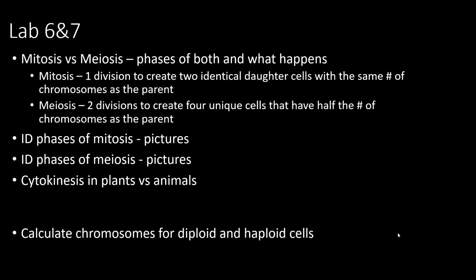You need to also be able to ID the phases of mitosis and meiosis through pictures. So you need to go back and review those labs with those pictures. And I'm going to show you a few on the next slide just to kind of go over them.